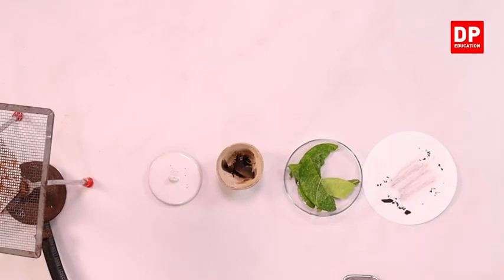By now you would know what it is. You have seen the observation. Black color is carbon. Carbon graphite, what we normally get from burning firewood, is also black in color. When you burn firewood, we end up with coal or charcoal. So this charcoal, if you draw it on a piece of paper, you will get similar black colored lines.